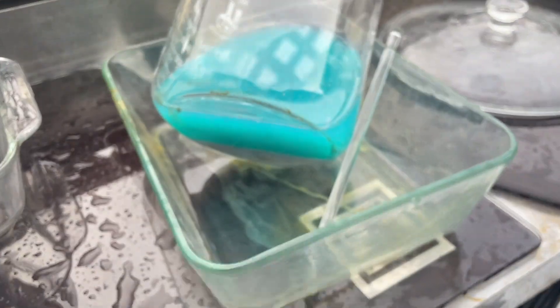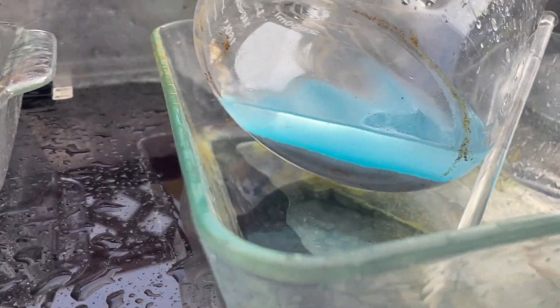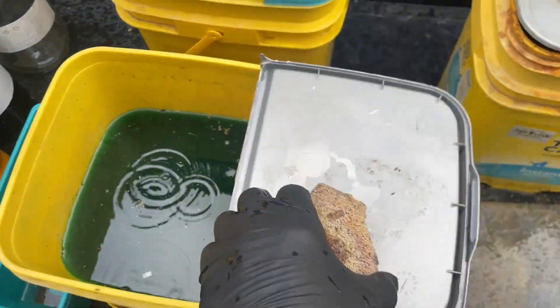Poured that off one time already. It's got a bit clearer solution sitting on it now. Maybe I'm gonna dump that off here too if I can do it without getting soaked in the rain we got going.